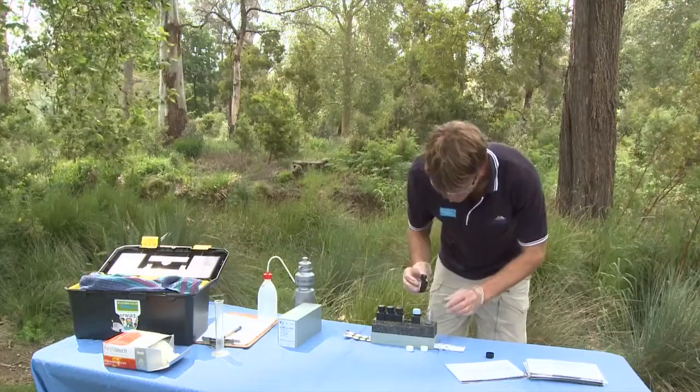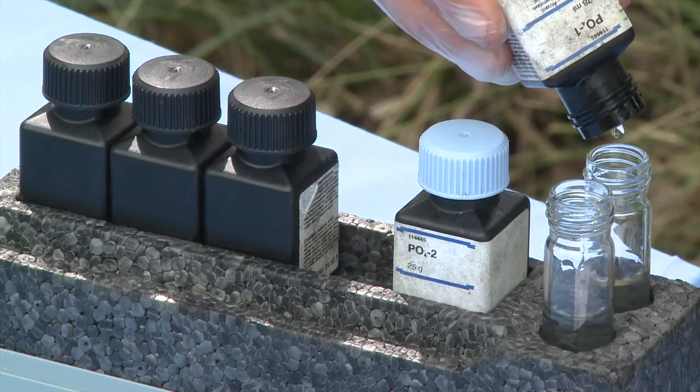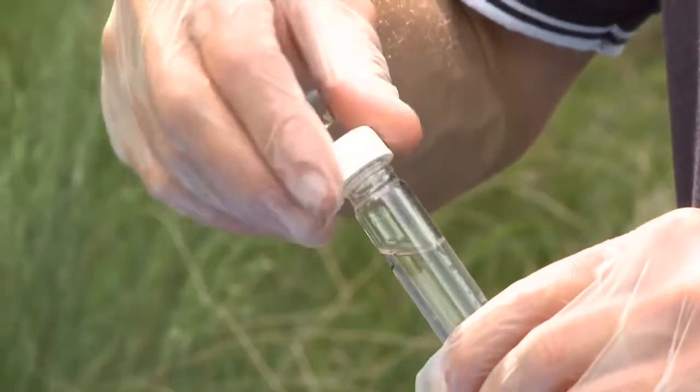Step 4: Add 10 drops of reagent P1A into the sample tube closest to the person testing. Replace the lid and mix.